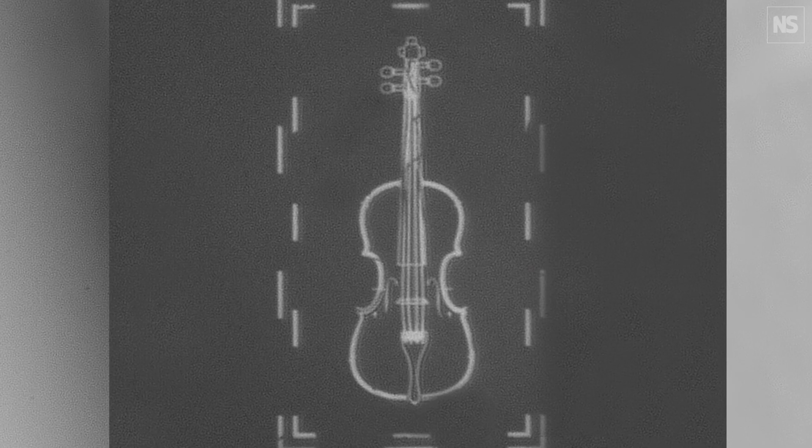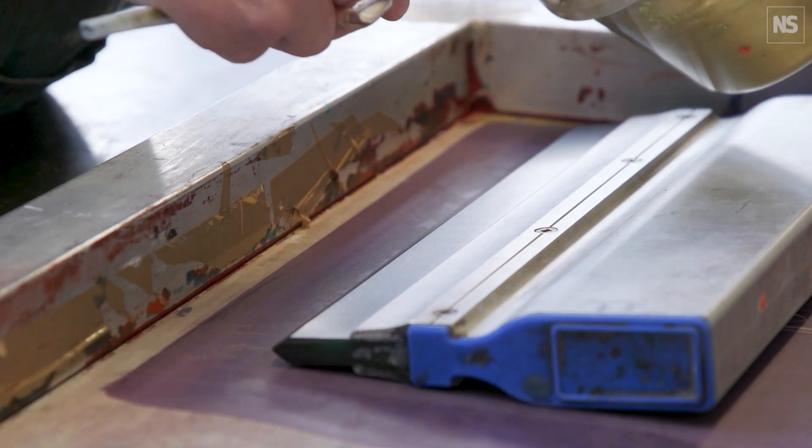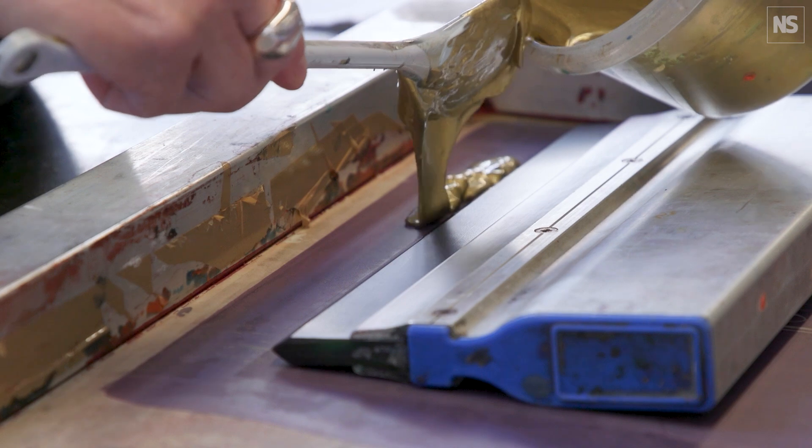Now that we have the platinum body of the world's smallest violin, we want to add the copper strings. And to do that, we just repeat all of the steps again.